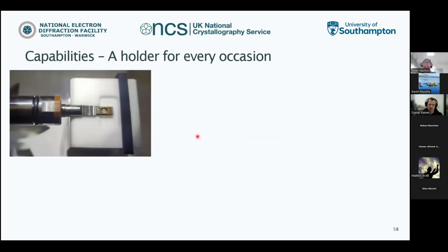And the way this works is, this again can be retracted, but now it's fully extracted. And this white part at the top here is an O-ring. So basically, this up here is a chamber that can be sealed off, and therefore the sample, if there's a grid here, will never be exposed to air. And hopefully, this protects the sample enough.